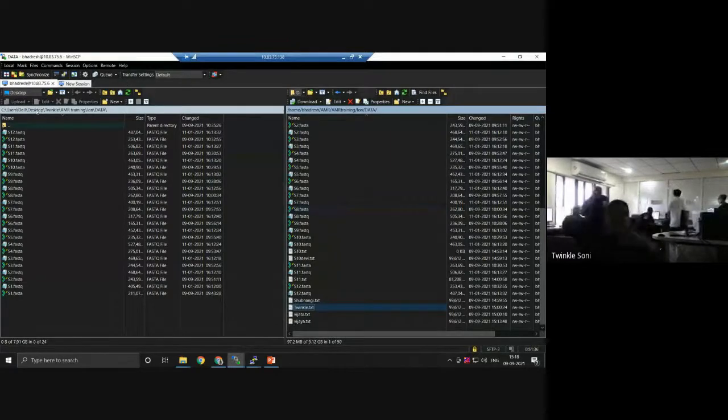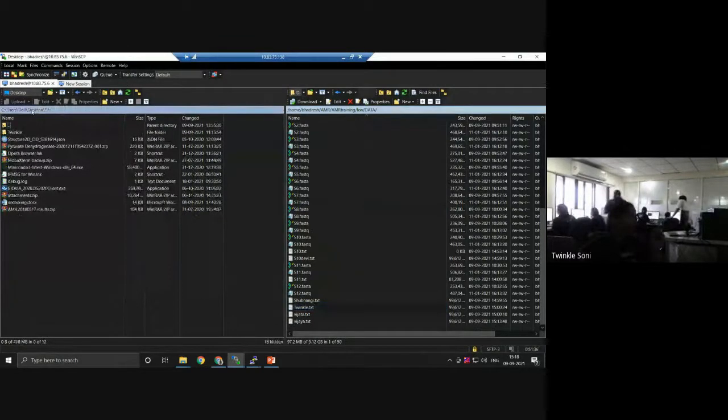Okay, so on the left hand side, click on the desktop. You will directly go to desktop. Click over desktop here on this side. Now we need to do downstream analysis, so click on desktop. This should be on the desktop. Drag it into your left window; the computer interface is on the server.